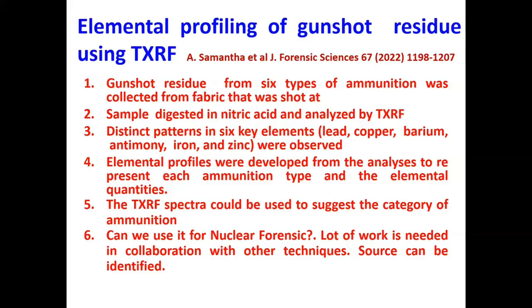And another question arises: can we apply this TXRF methodology for the analysis of nuclear forensic samples? A lot of work is needed in collaboration with other techniques so that the source can be identified. Here I would like to say TXRF has one weakness, that it cannot analyze the isotopic composition. But at the same time, it has one advantage, that it can be used for speciation, which I will tell later.